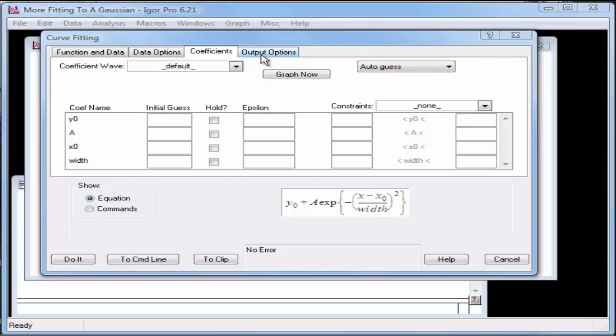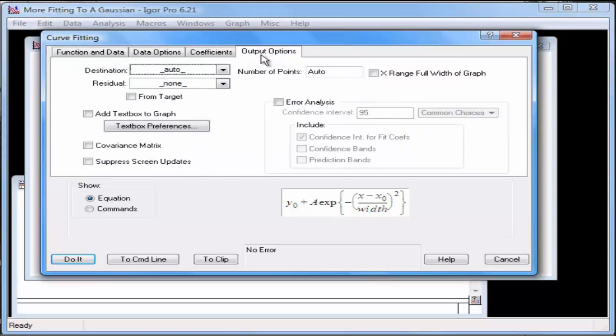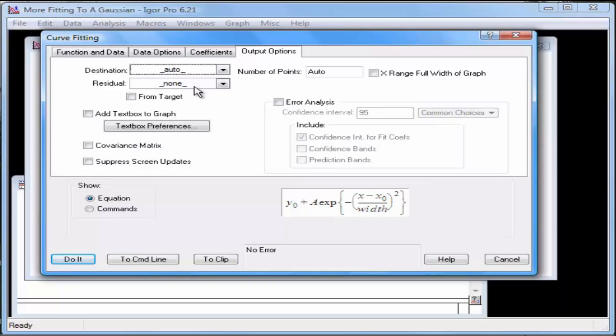Click the Output Options tab. The Destination pop-up menu should read Auto, and the Residual pop-up menu should read None. Click Do It.